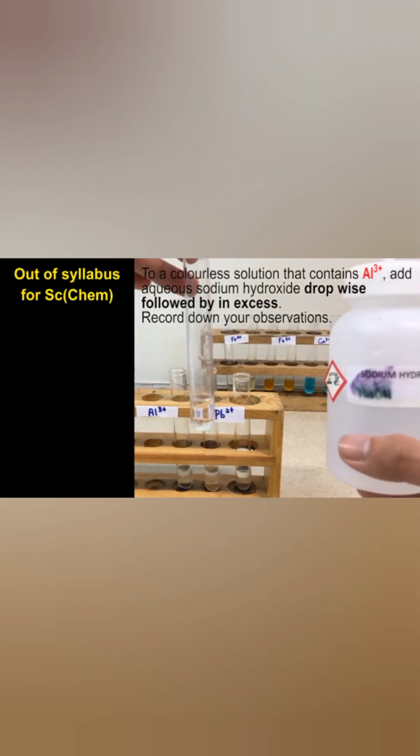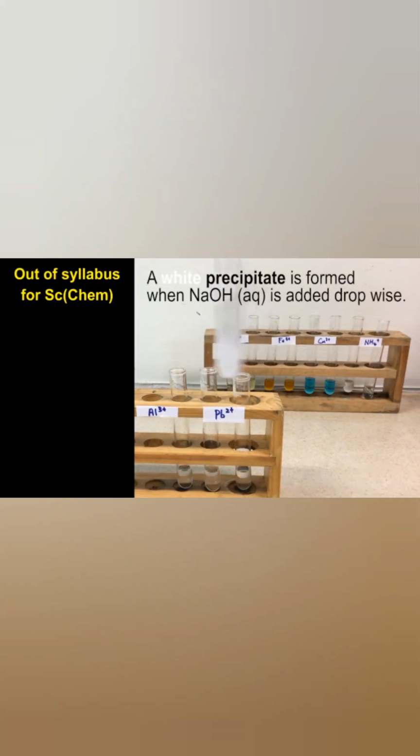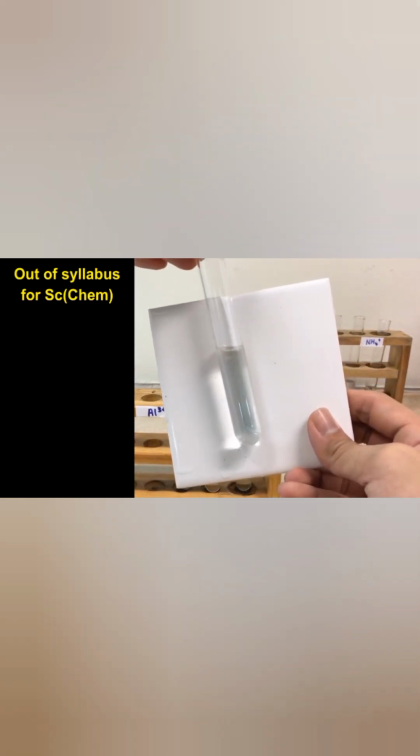Okay, now go to aluminium. If you add sodium hydroxide in drops to a solution containing aluminium, a white precipitate is formed. Adding sodium hydroxide in excess, the white precipitate dissolves. The white precipitate dissolves in excess sodium hydroxide.